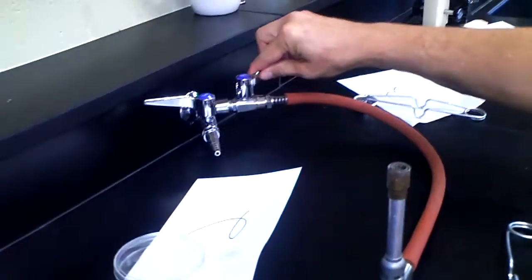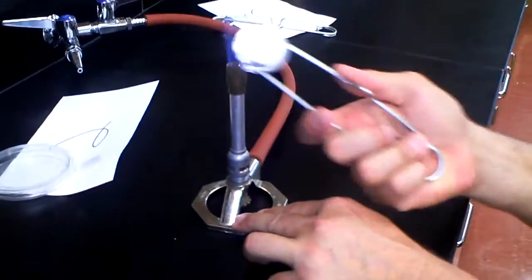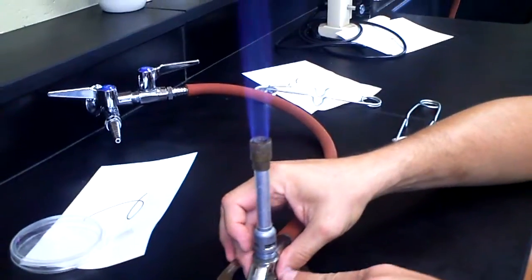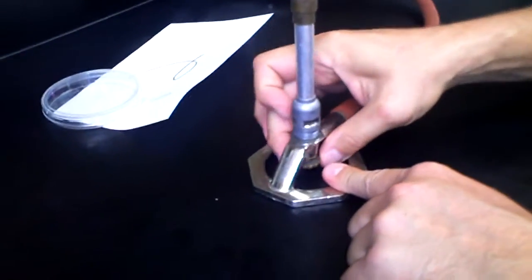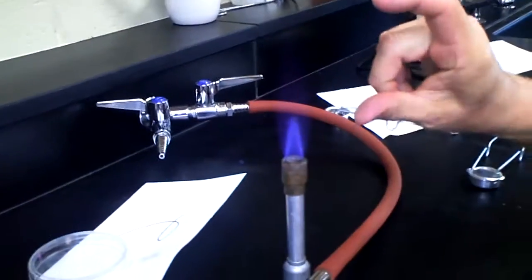We turn the valve on to parallel over here. Gas is now coming out. We light the burner. We have to adjust our flame so that it's a blue cone inside of a blue cone. We're going to turn our valve down here, righty-tighty. We want a one-inch blue cone inside a blue cone.